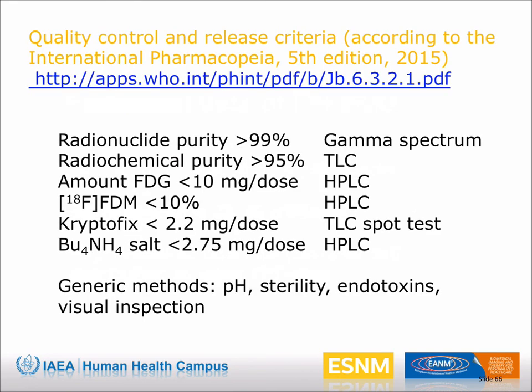The release criteria for FDG are described in several pharmacopoeias, including the International Pharmacopoeia of the World Health Organization. The criteria are quite comparable amongst the different pharmacopoeias. Besides the generic methods that apply for all radiopharmaceuticals, there are specific requirements for FDG.